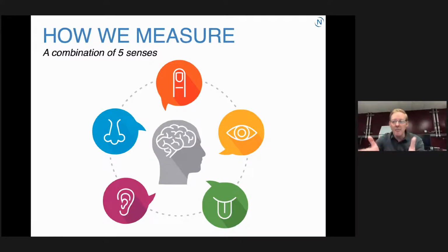And it's through this combination of all these techniques, which I don't have time to talk about today, and we certainly don't have time to tour, that we get a full understanding of the world and the materials we're developing at this smallest of scales, where things don't necessarily behave as we would predict them to behave because of this unique size scale that is known as the nanoscale.